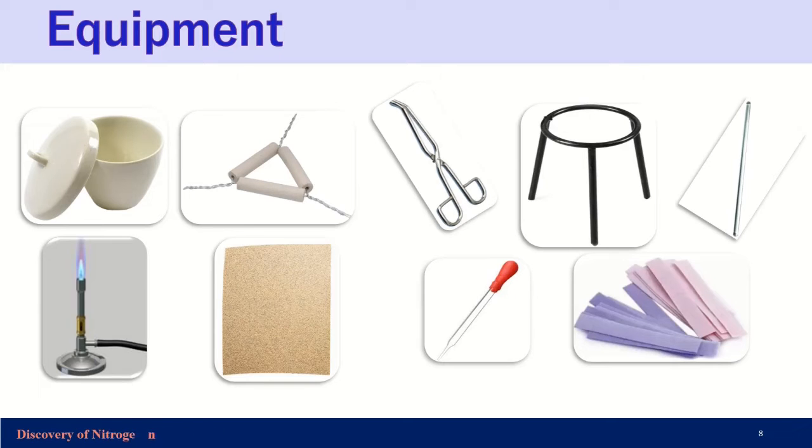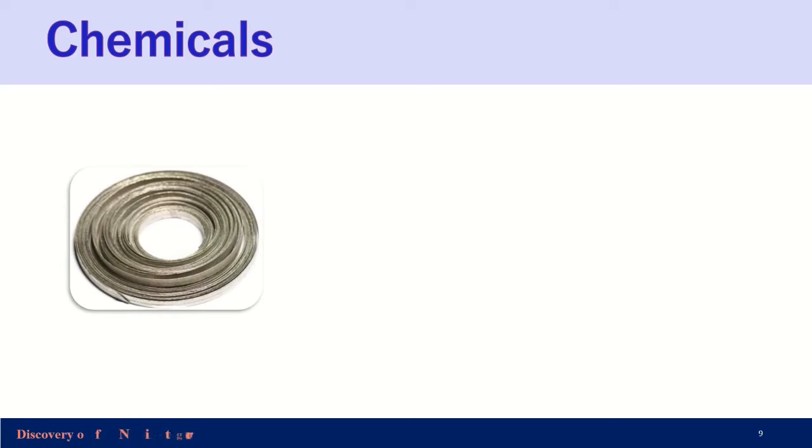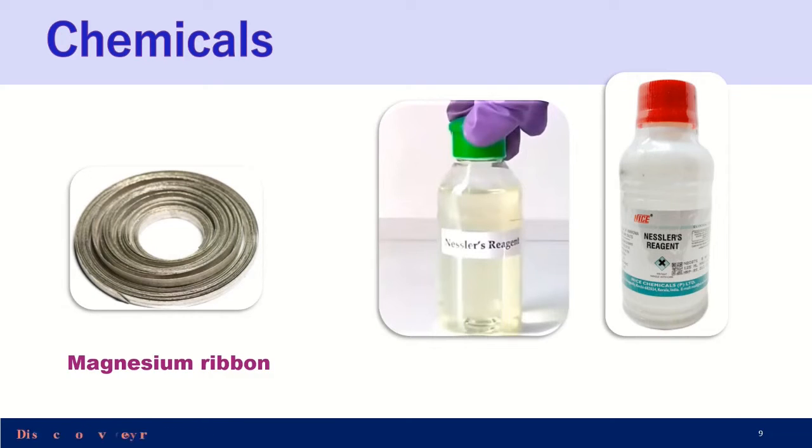You also need some chemicals: a magnesium ribbon and Nessler's reagent.